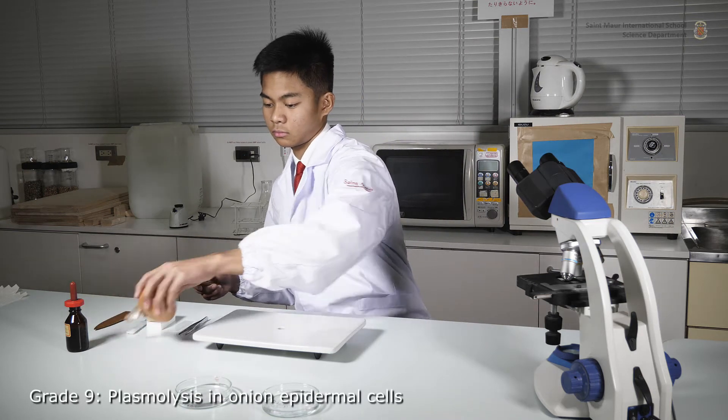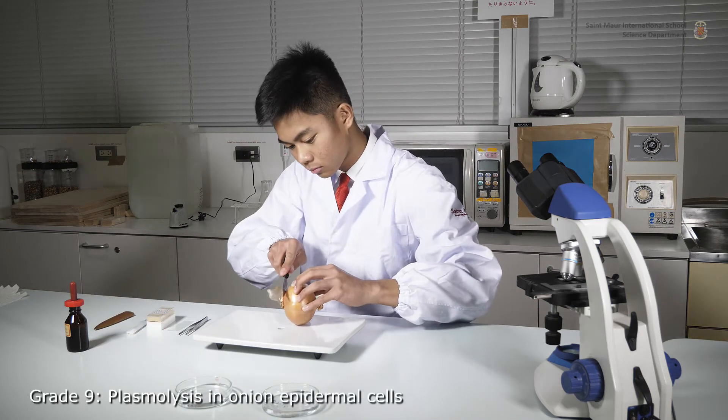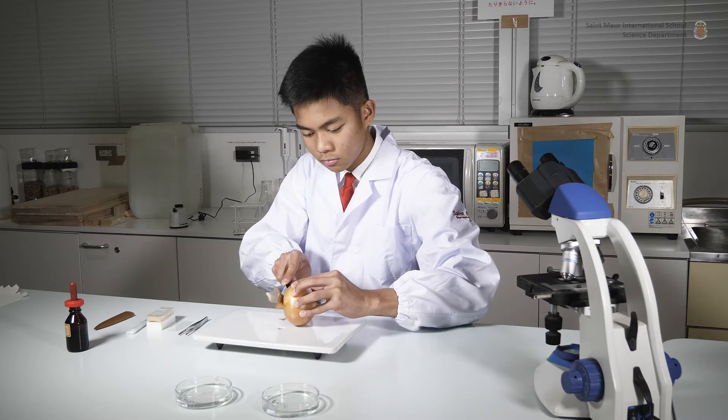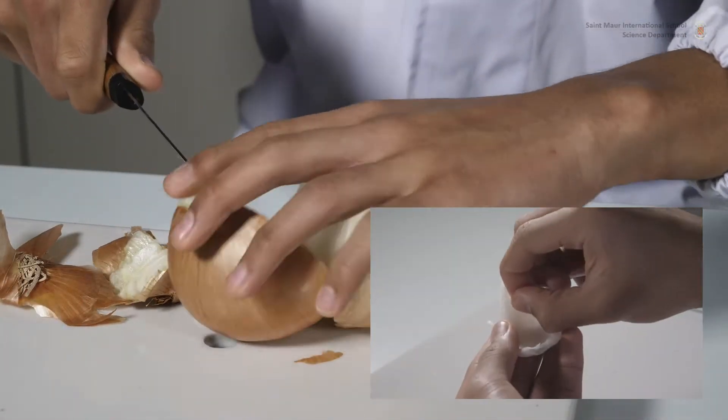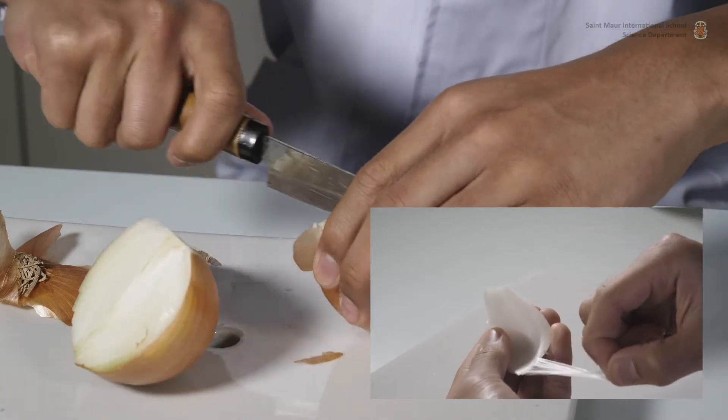First, cut a white onion into four to six sections. Onion is an ideal model organism to study plasmolysis because its epidermis is easy to peel off and quite resistant.